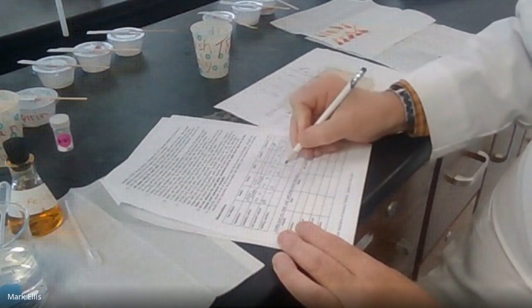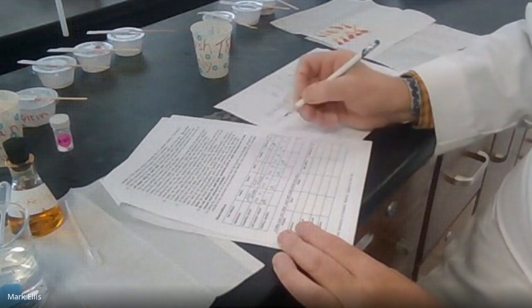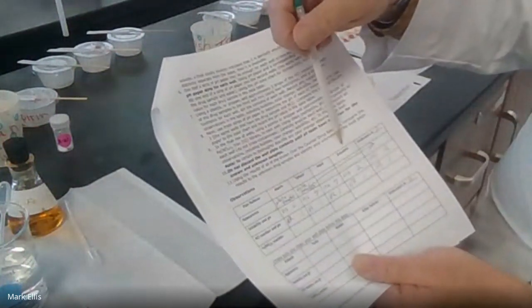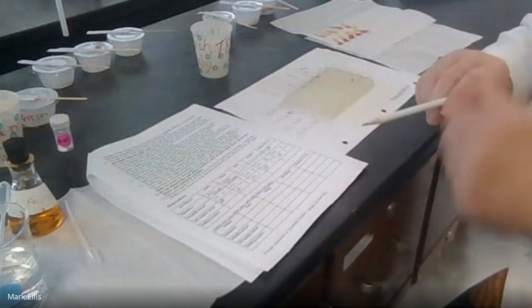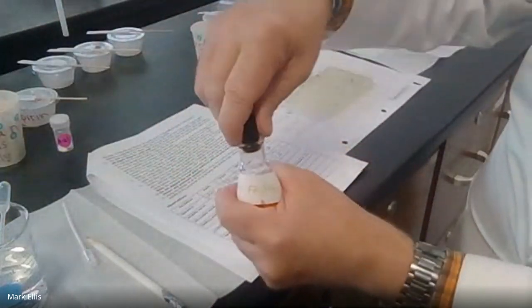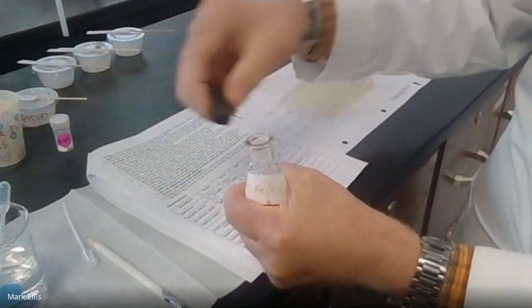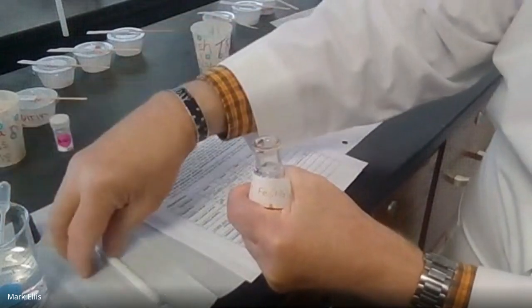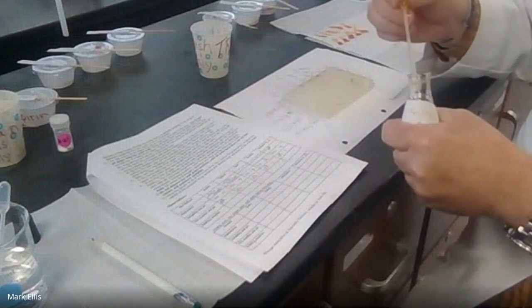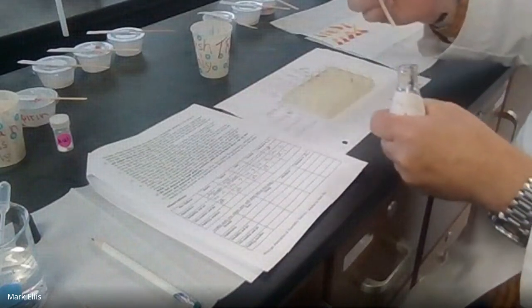All right, so this test was pretty much inconclusive. It doesn't refute either the aspirin or the Excedrin, but it's still about the same. Now for the bottom row, we're going to take about 5 drops of the iron 3 nitrate. So carefully take the top off. It doesn't have to be exactly 5, but if it's 4 or 6 or 7, that's fine.